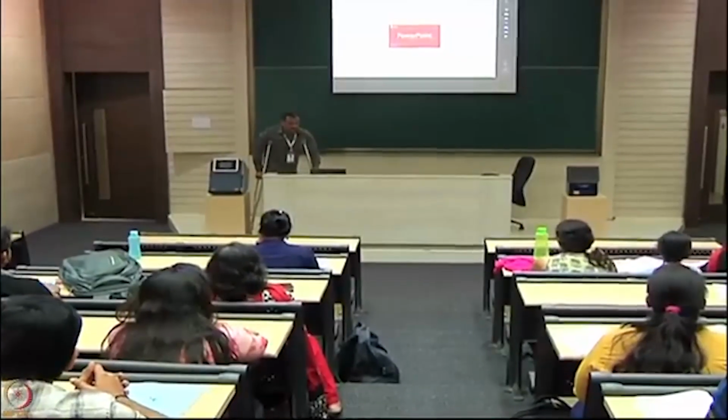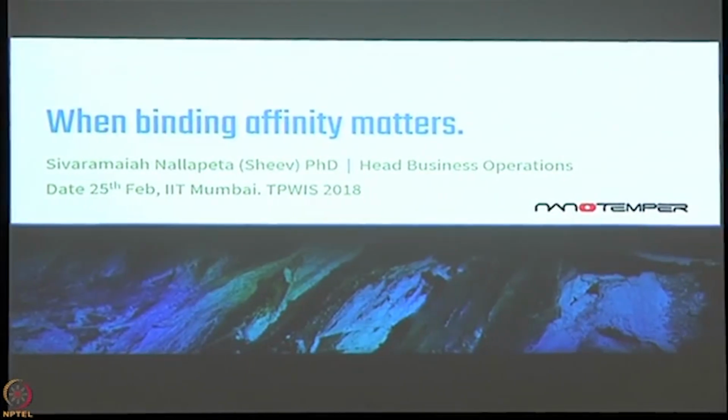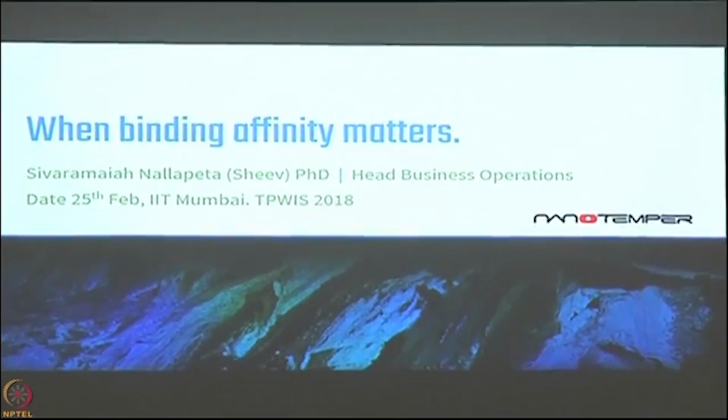I will quickly start my presentation without wasting much time, but before that I would like to know, are you doing any biophysical assays for interaction studies, protein, small molecule? If you are working on those lines, for sure this talk should be very interesting to you. This is a biophysical technique that determines binding affinities, how you determine the binding affinity between two biomolecules. It can be anything, protein, small molecule, protein-ligand, anything you can determine the binding affinity.